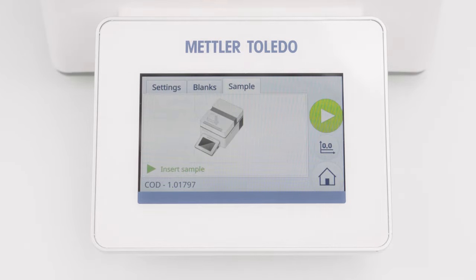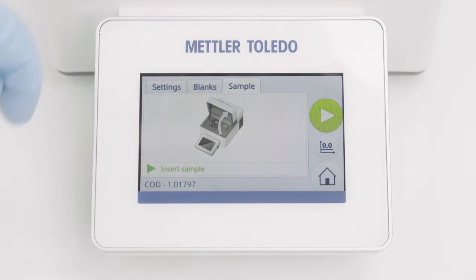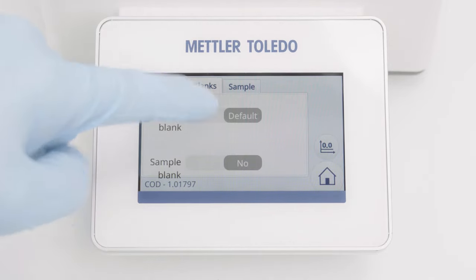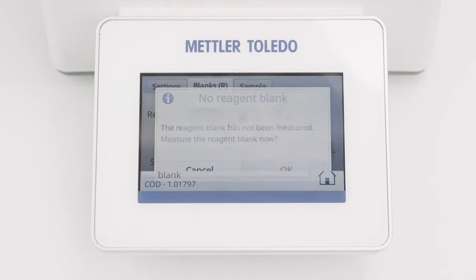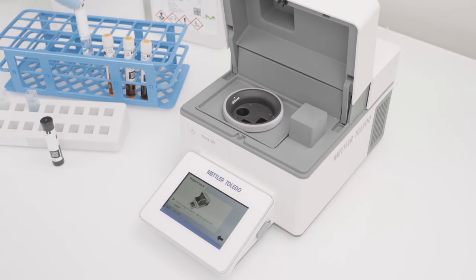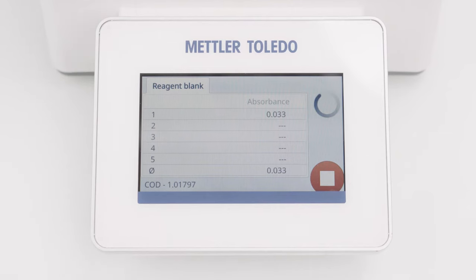To measure in User Reagent Blank, I click on Blanks and tap on the slider. As no User Reagent Blank value is stored, I am confirming to measure one. The instrument asks me to insert the Reagent Blank cell. I am inserting the Reagent Blank cell, close the lid, and the measurement starts automatically.